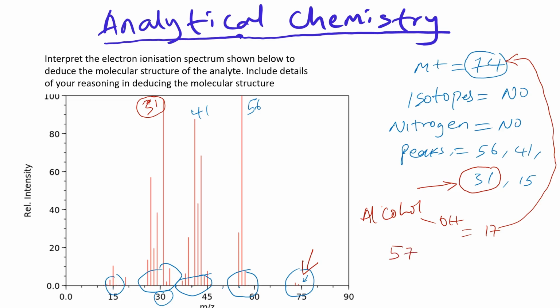So 57 is basically the molecular mass of the alkyl group that is present without the functional group of alcohol. Then I'll divide this 57 by 12. That will give us the estimated number of carbon atoms. It might not be exact, okay? So we have 4.75. Now 4.75 doesn't mean that the carbon atom count is 4. So I'll use a range of 3 to 5 carbon atoms.